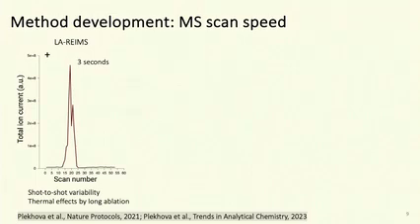But in terms of method development, you also need to take a look at your sample and your signal generation system. In terms of LA-REIMS, they're usually very narrow, very small peaks of an ablation event. Why don't we want to make them wider? Well, because we might want to deal with shot-to-shot variation of the laser at the first instance. On the second instance, we apply energy and we heat our samples, which implies that over time certain deterioration events will take place that will affect the quality of your obtained data. And also there's a danger of cross-contamination of your samples.